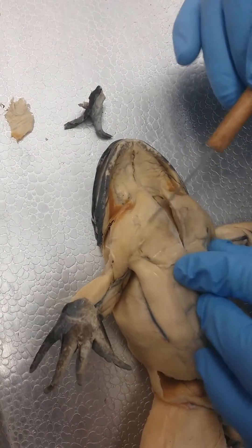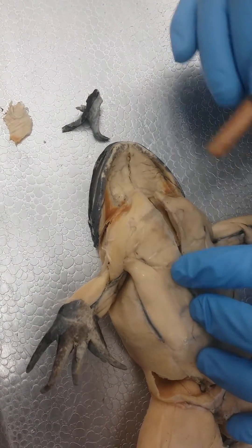Right here, this piece here and this piece here — these are both pectoralis.